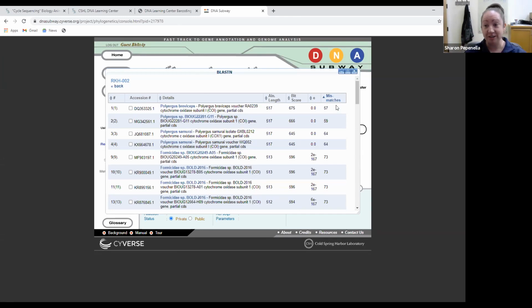So this was some of the first data that we got back from this US Ants project. So we're certainly excited to see what the rest of your projects are bringing in, because I think we're going to see a lot of cool stuff like this as well. So for all of your sequences, we will indicate whether or not the sequences are novel, whether they're novel GenBank entries, whether they're a polymorphism. Even if there's a few differences in your DNA sequence, or even if it's identical, we will still publish all of your sequence information to GenBank, because even that will provide us GPS records.